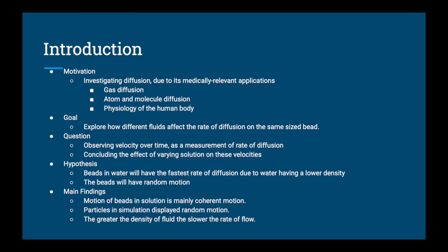Throughout all of our microscope videos, we recorded the upper layer of beads that were moving and saw that the beads mainly moved in an oscillating motion together in one direction. Therefore, the beads' movement appeared as coherent motion instead of random motion. However, since random motion takes place in 3 dimensions, the limitation of the AmScope recording from top down could have prevented us from viewing the full random movement.